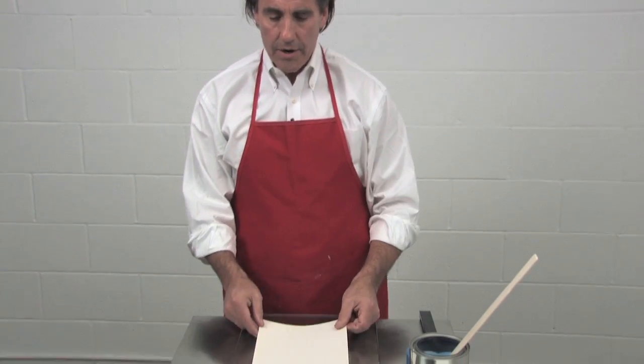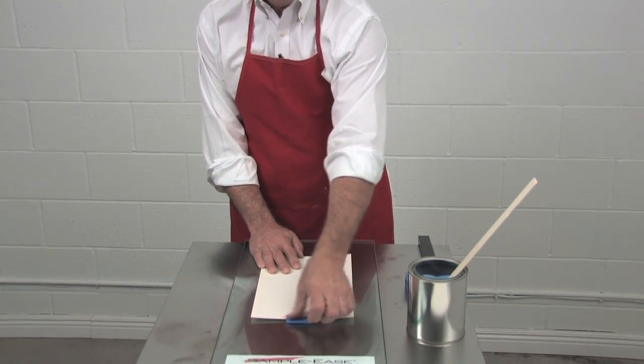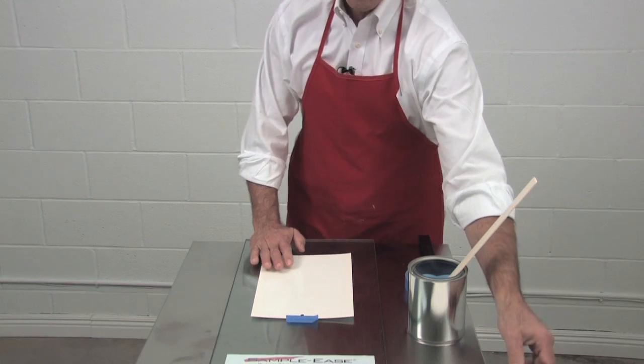I'll be demonstrating how to make a drawdown for an architectural drawdown or laboratory drawdown. First you start with your drawdown card, place it on the counter, and with a piece of painter's tape, tape the top down to secure it while you're making the drawdown.